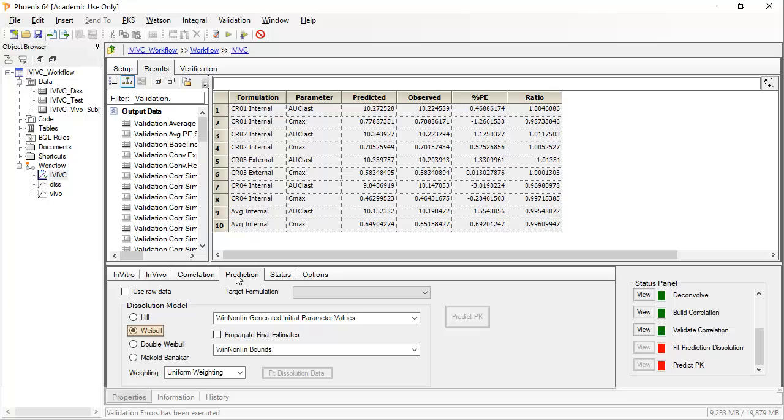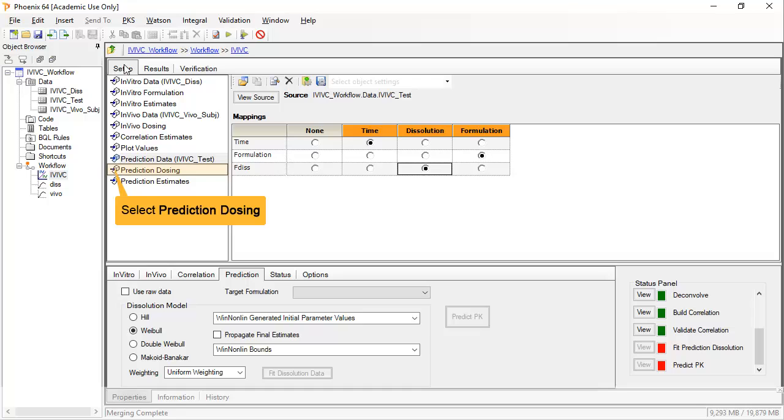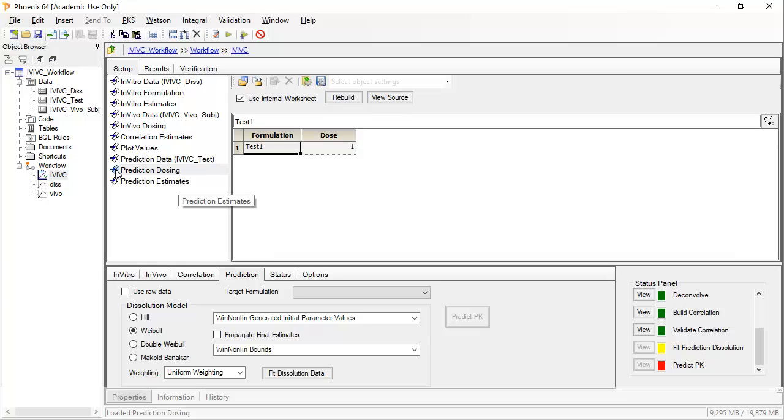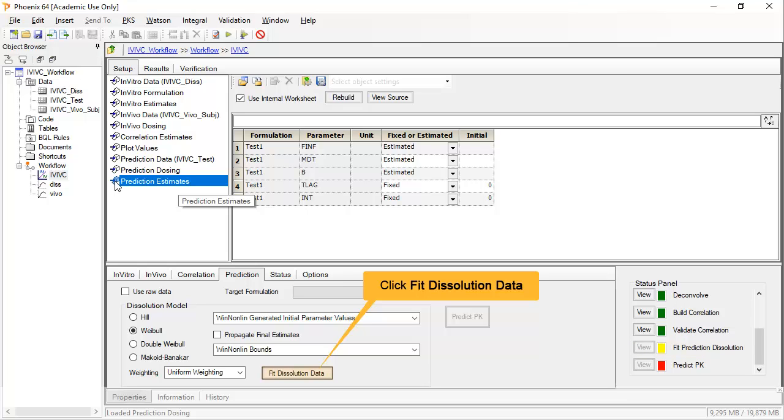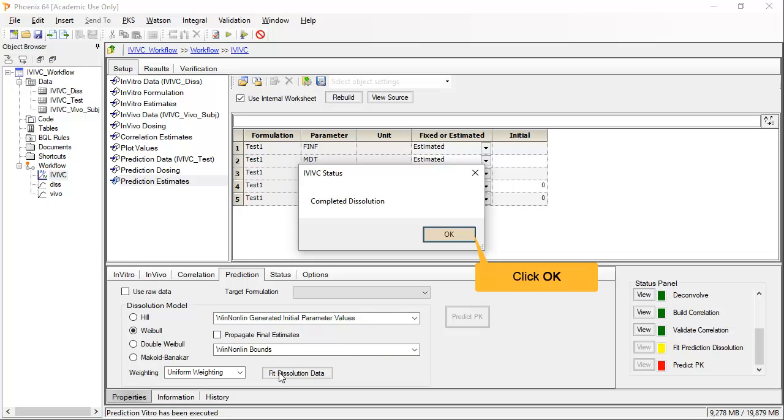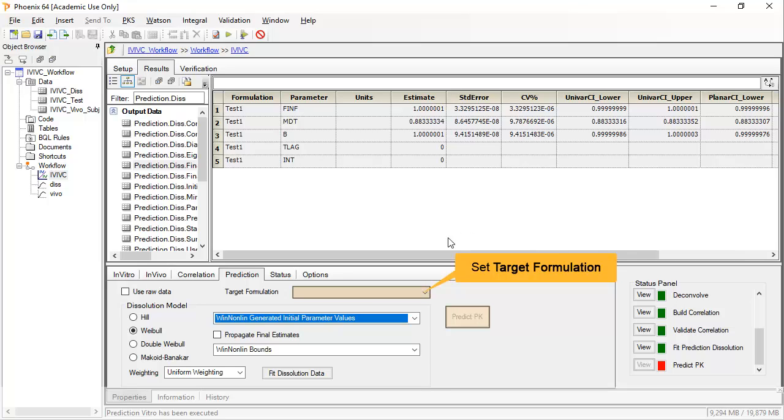Within the prediction tab, be sure to use the same dissolution model for test as for the original dissolution data. In the setup for prediction data, we see the sources test containing just the dissolution data from the new formulation. And just like the original data, we can set the formulation strengths as well as the initial estimates. At this point, the status panel is yellow, indicating the dissolution is set up but not yet executed. The predict PK button is not enabled at this point because the target formulation has not yet been set.